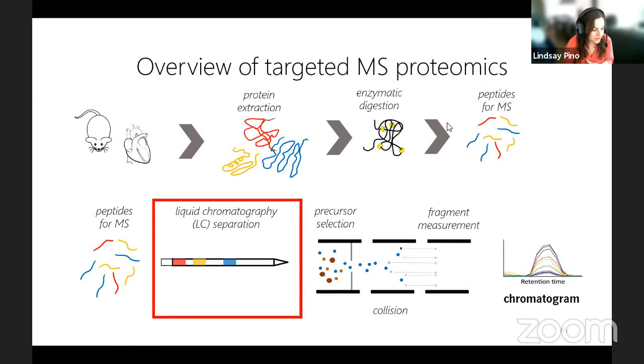How many fragments are necessary to confirm peptide identification? Typically around 3 to 5. I think 3 to 5 fragment ions is what most people use. Can you be sure? Oh my goodness.